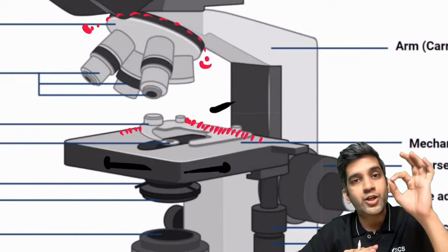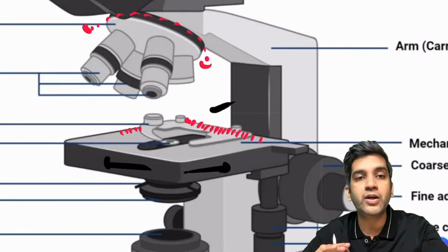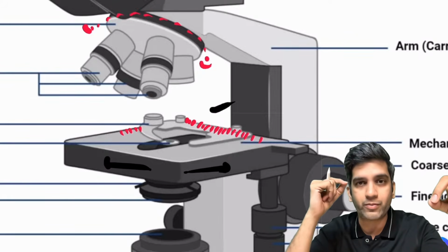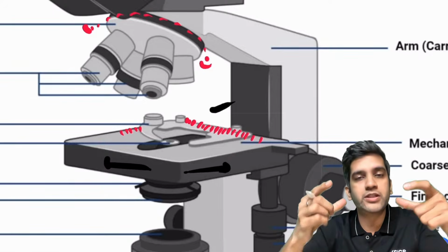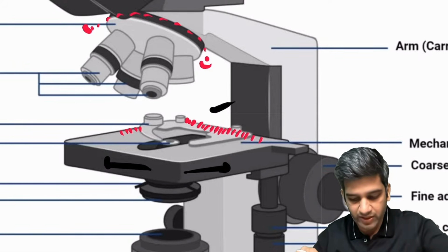If you haven't noticed, tomorrow when you go to the practicals of pathology or microbiology, wherever you see the microscope, go and have a look. There'll be markings. The markings are very important for me. Why is it important? We'll see very soon. The stage has 2 purposes: one is to hold the slide and the other is to have markings. The use case of the markings we'll see very soon, right?